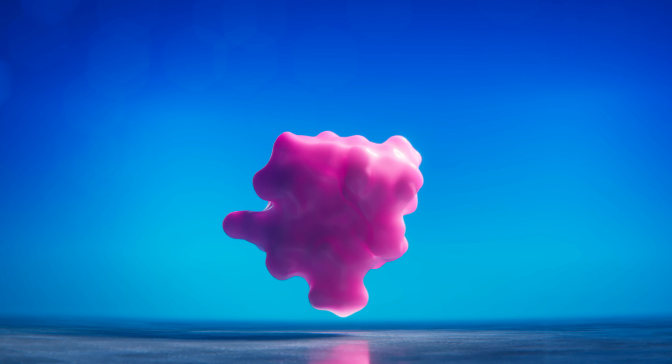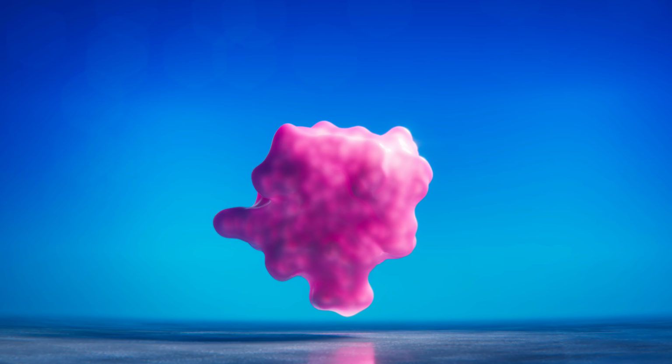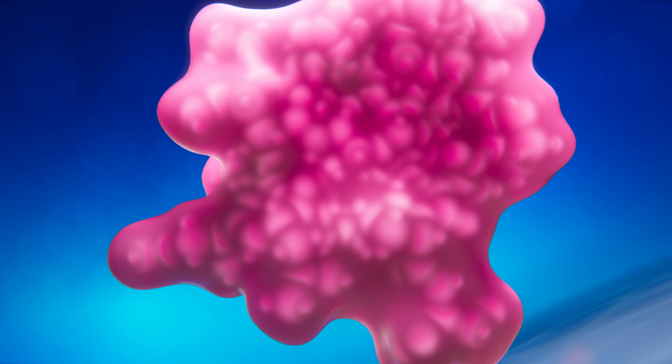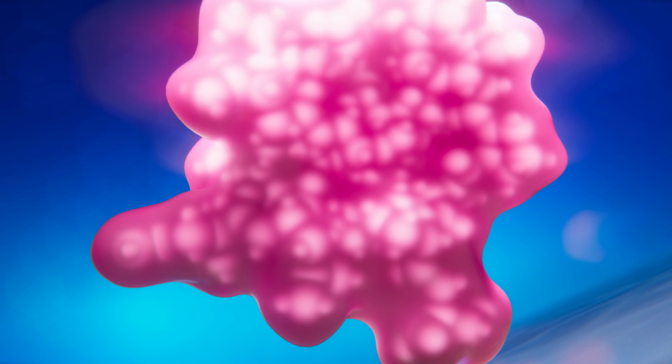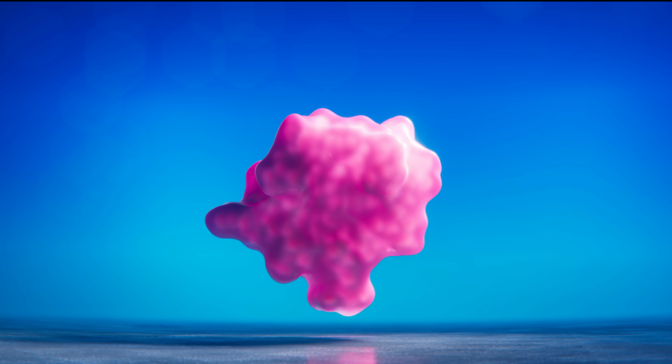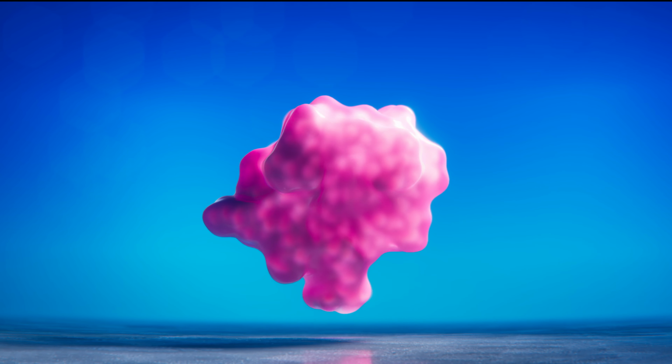Proteins are made up of sequences of amino acids, which determine a protein's structure and function. When it comes to understanding biological processes, identifying these amino acids is key. However, no technology currently exists that can sequence the amino acids of proteins at the single molecule level.